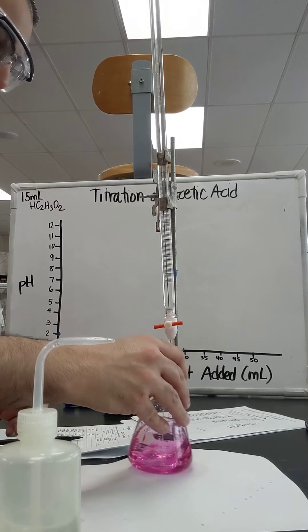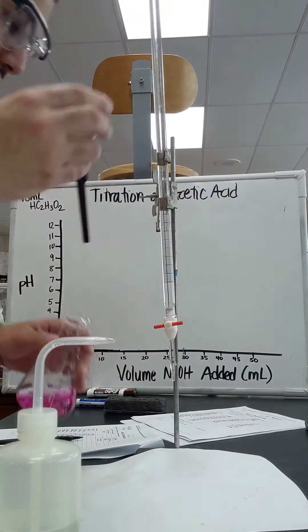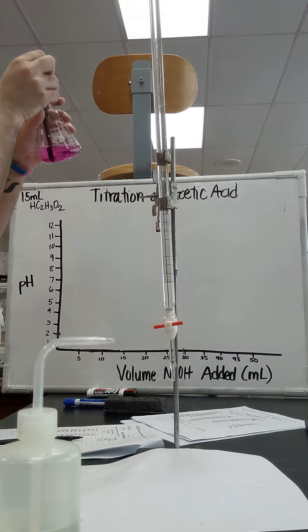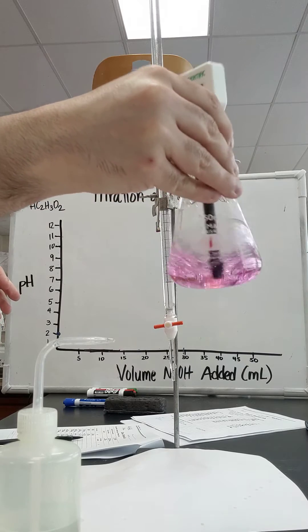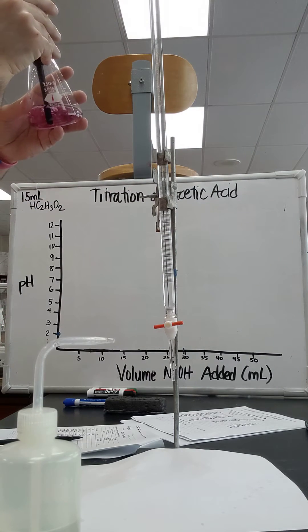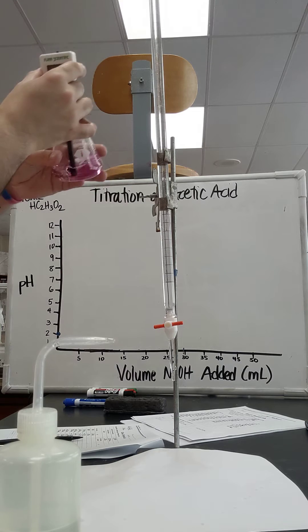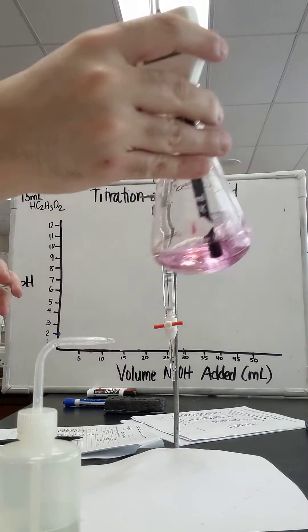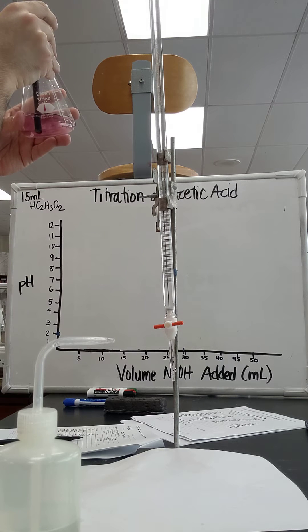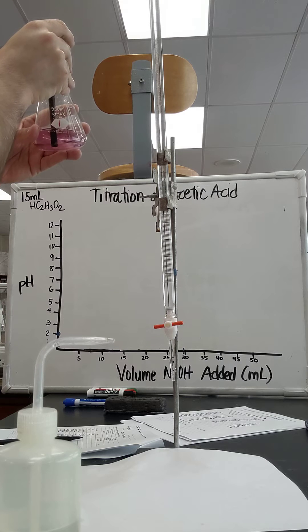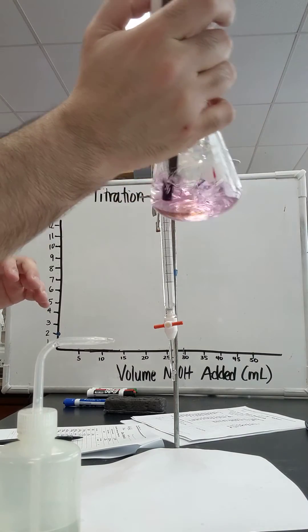Not as dark as the other one. Taking the pH. And I've climbed to about... Look, and the color's kind of disappearing a little bit after swirling a little bit more. But now I have a pH of about... It's slowly increasing. And the color's going away. I got a pH of about 7.8. Oh, 8. And the color is fading even more.